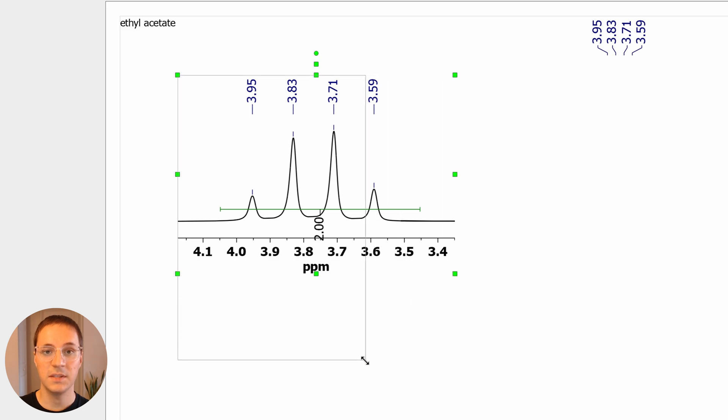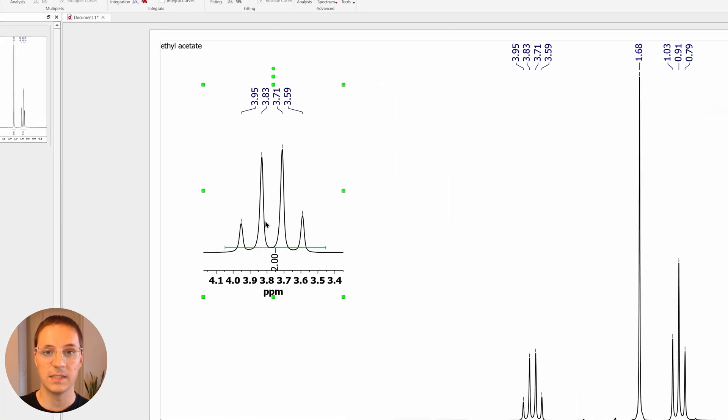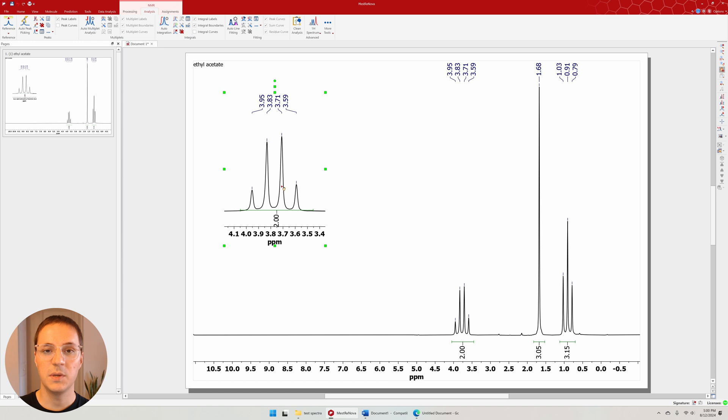The pan tool can be accessed by pressing P. This can be used if labels are overlapping the spectrum.